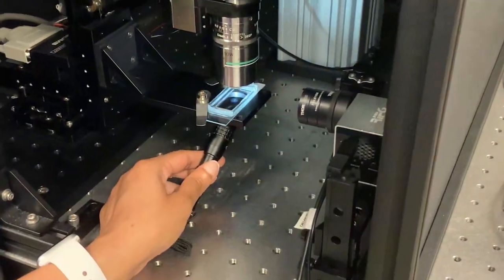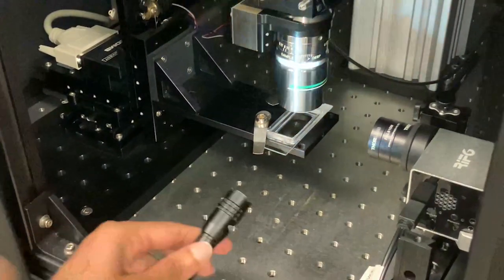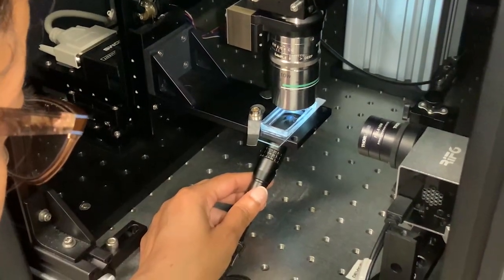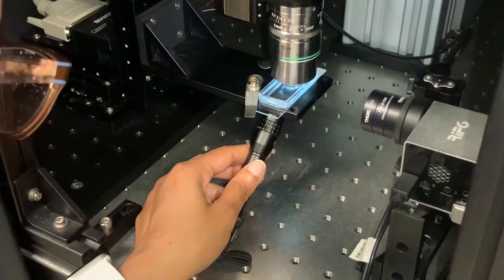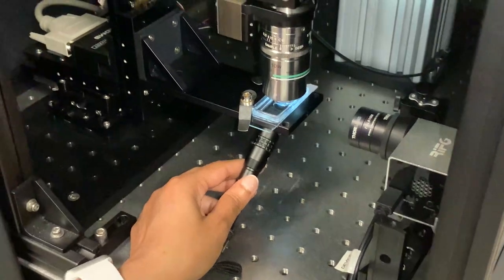To understand the development of the neural circuits that process visual information, as well as the genetic basis of assembling these circuits, we can image neural activity while providing well-defined visual stimuli. We provide these visual stimuli using a picoprojector, shown here to the right of the microscope.